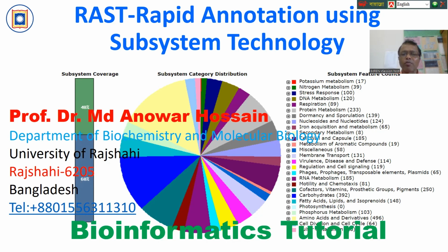This is a bioinformatics tutorial. Today, I would like to talk about RAST, Rapid Annotation using Subsystem technology. So this is a bioinformatics tutorial for genomic analysis, or particularly bacterial genomics.